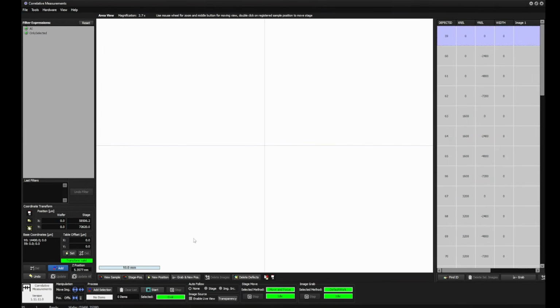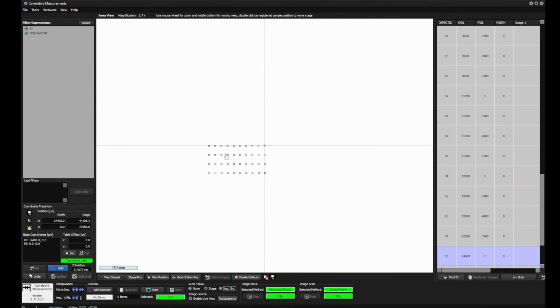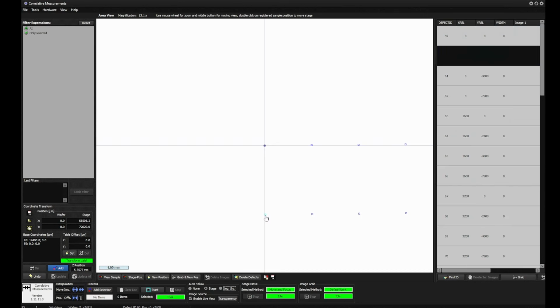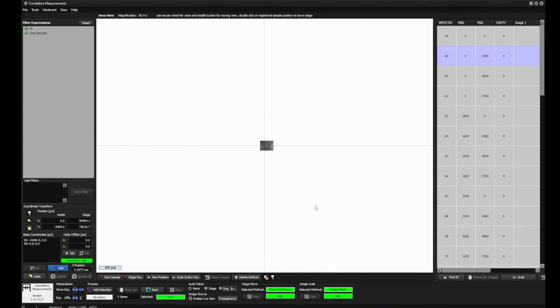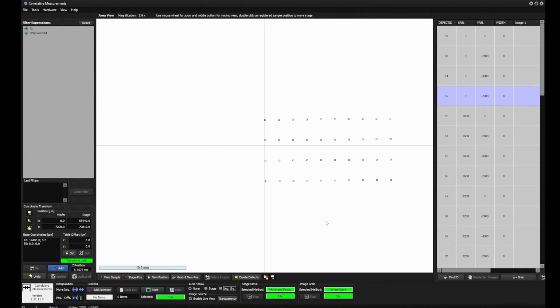If everything works, we have an aligned coordinate system. Let's go back to this one here. You see, if we look in the live image, it's there. We are here. Now the others should work as well. This is also there, and we should maybe have 3 points. That is the best coordinate system.